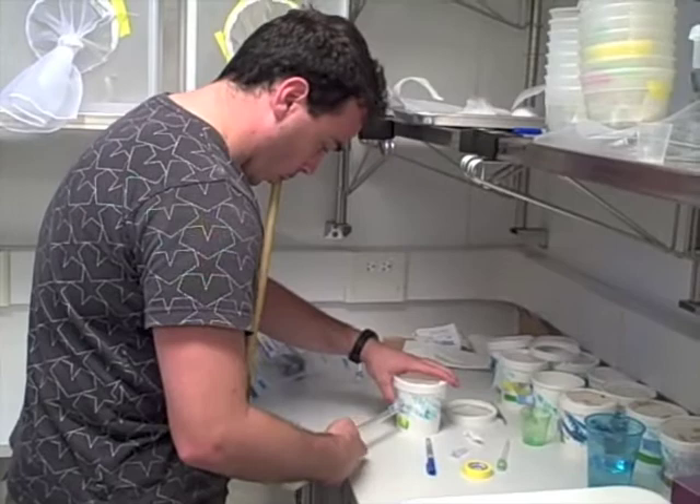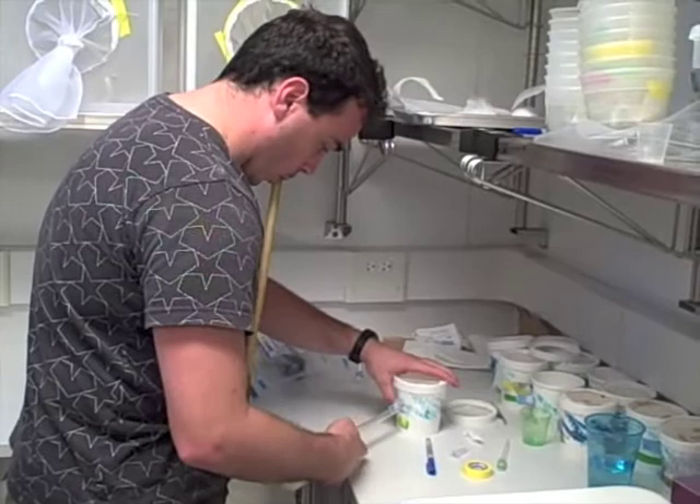I hatched eggs in these trays and the larvae have grown up and now I've got mosquitoes which I'm segregating — so I'm taking the males out to test and then putting the females in cages.